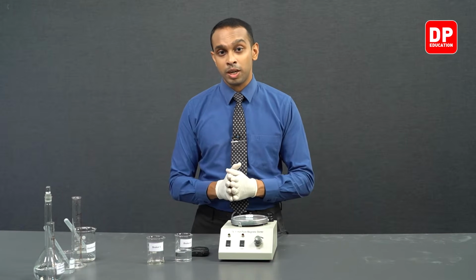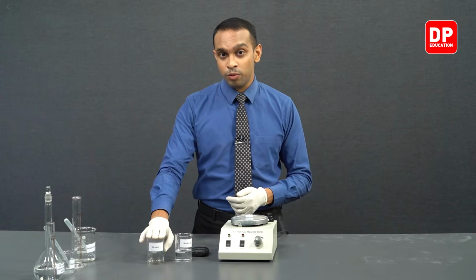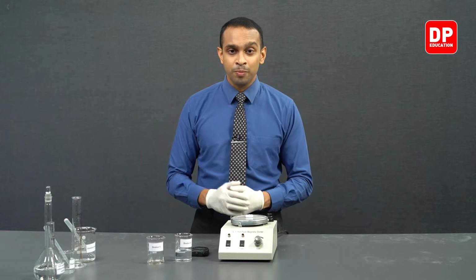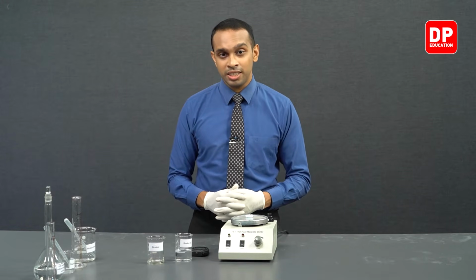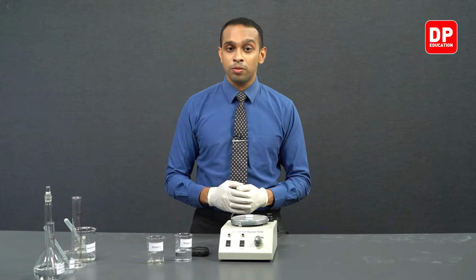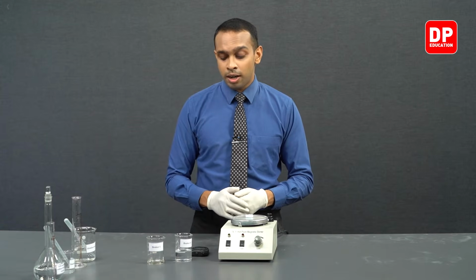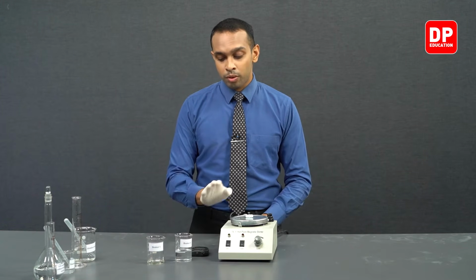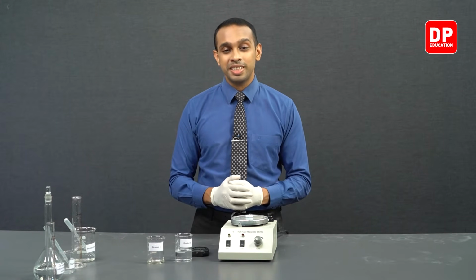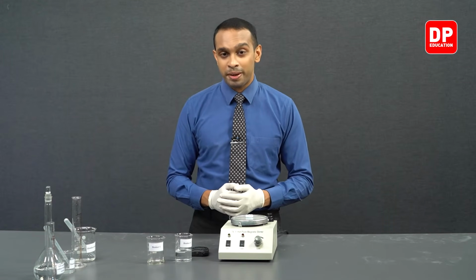This was not the case in the previous 4 instances, but in this 5th reaction, you will observe that even if we keep the reaction going for about 5 minutes, you will not see a color change. This is because the amount of I2 produced is lower than the amount of thiosulfate ions present in the medium. However, we will observe this so that we can be very sure. So we will mix these reactants together, turn on the stopwatch, and see if we get a color change at least within 5 minutes.